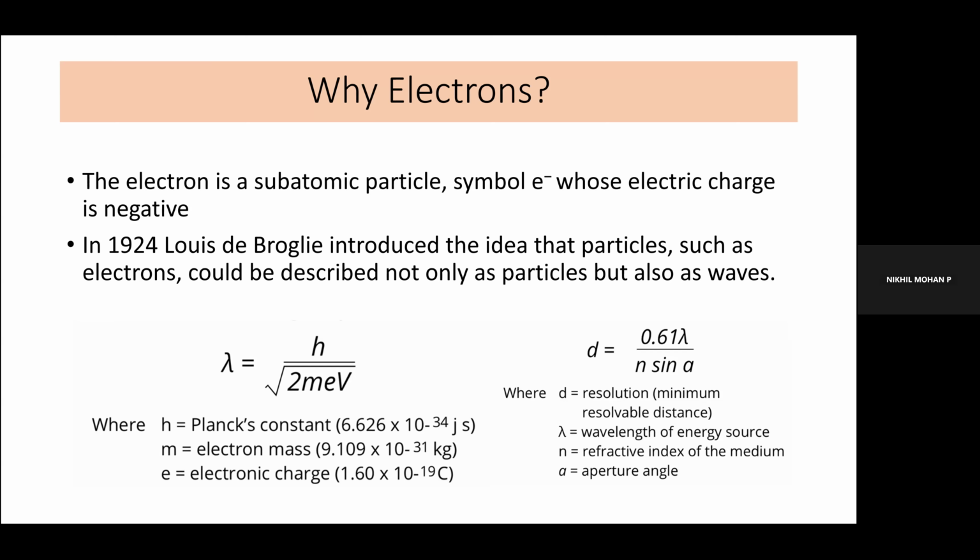So electrons can run from the source to the accelerator. That is how we are generating the electron beam. That's why if you check any electron microscope, there is a specific operating voltage. For SEM, it's about 5 kV to 50 kV. In TEM, it's about 80 kV to 300 kV. That is the electron gun and acceleration voltage that we use.